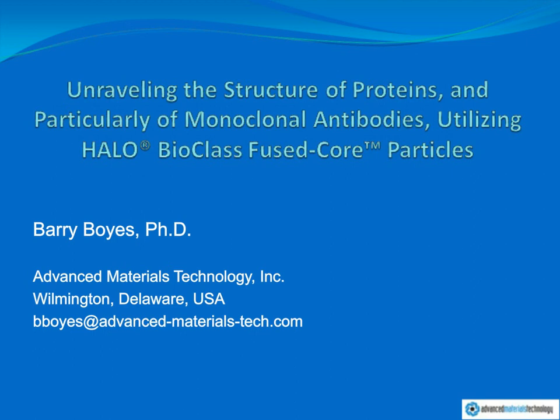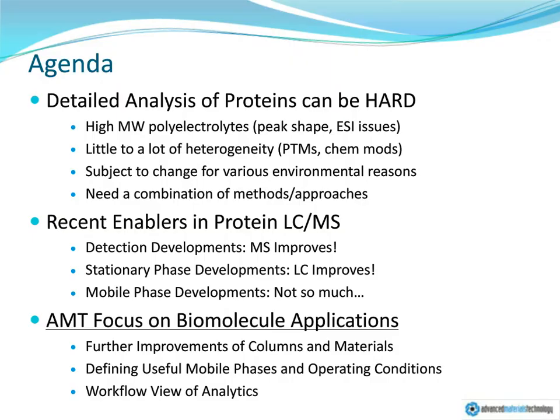The majority of the work that we'll be discussing concerns the use of superficially porous particles and of the Halo products, which for bioanalytical applications are referred to as the Halo BioClass Fused-Core products.